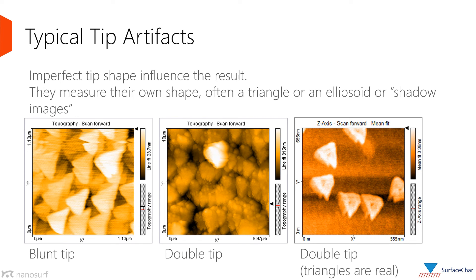The AFM tip mechanically samples the surface, and thus the condition of the tip has a direct impact on image quality. Shown here are two common tip artifacts due to a damaged tip. A blunt tip will contact features with its sides; for a tip with a triangle cross section, every feature will look like a triangle. Another common artifact is a double tip, where instead of one apex the tip has two, resulting in the duplication of every feature in the image.